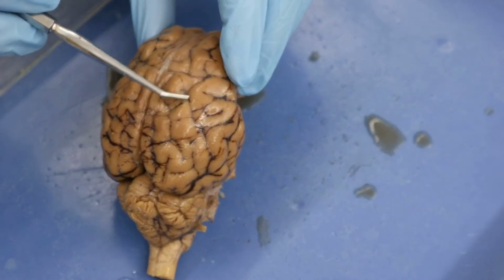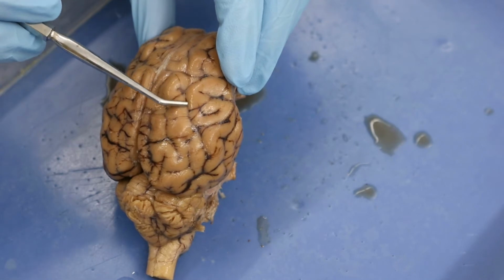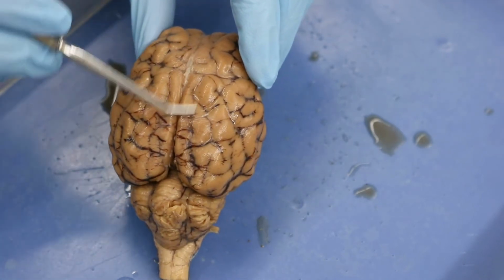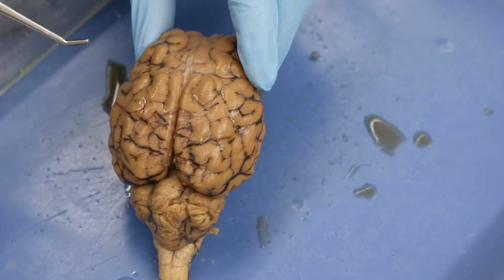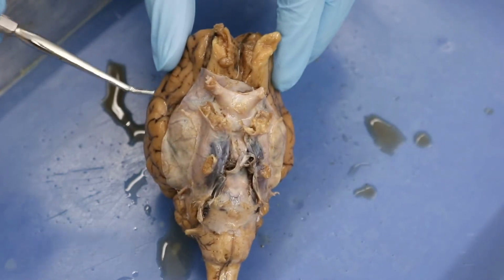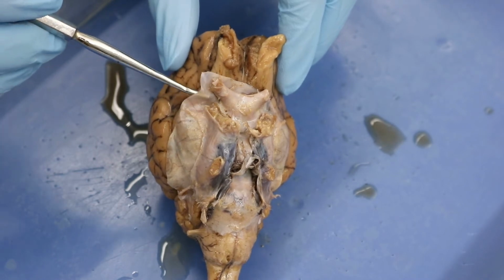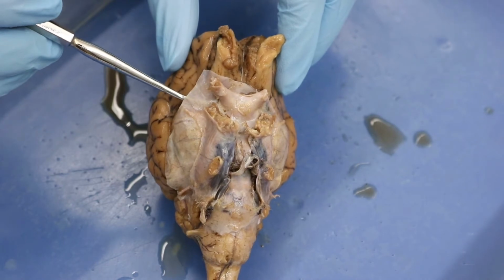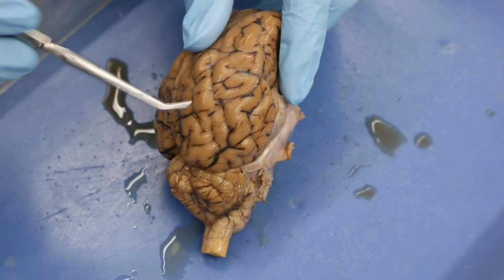Now, you'll notice that I can't really stick my pointer down into a sulcus, and the reason for that is we still have a little bit of meninges on here, but this is only the pia mater. You can tell because on the back side here, or rather the inferior side, we have a very tough layer here. That is very obvious, and the tough layer would be the dura mater, okay? But the pia mater continues to protect on this side.